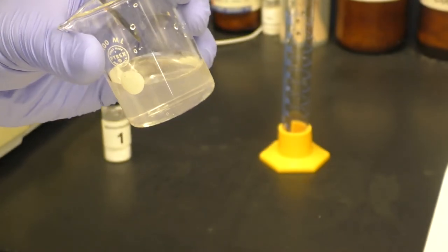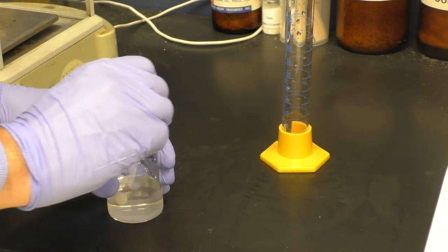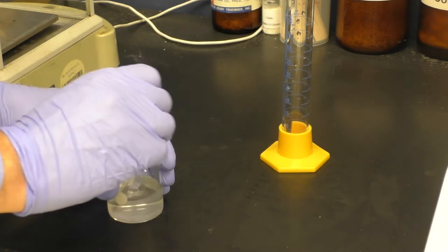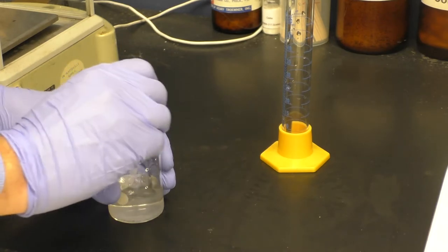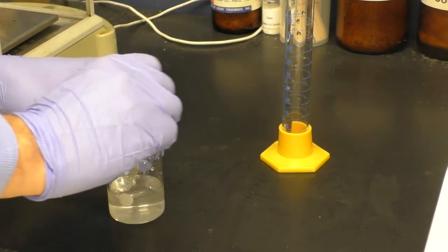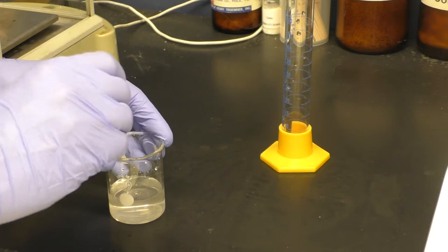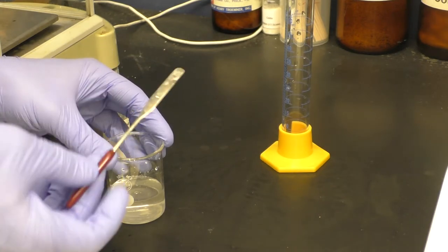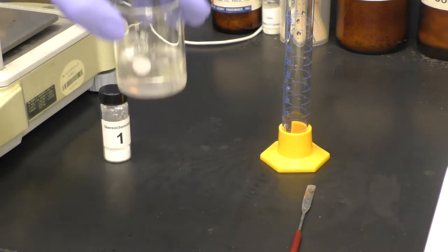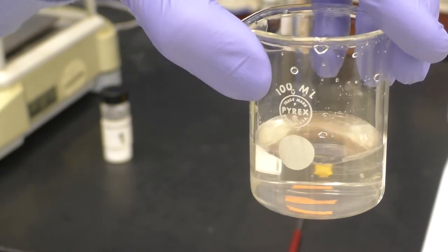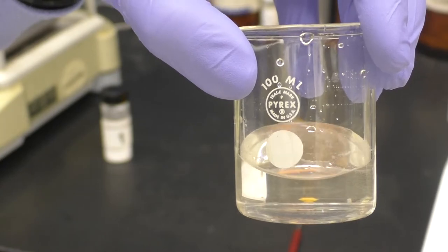We want to continue to mix until the solution is fully homogeneous and all these little chunks of material have fully dissolved. This is now sufficiently homogeneous to take to the polarimetry cell.